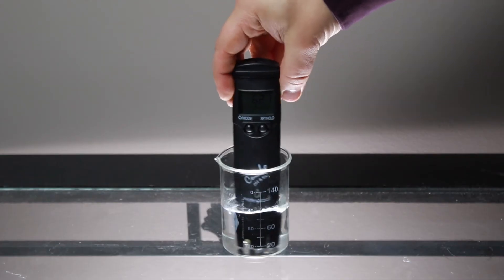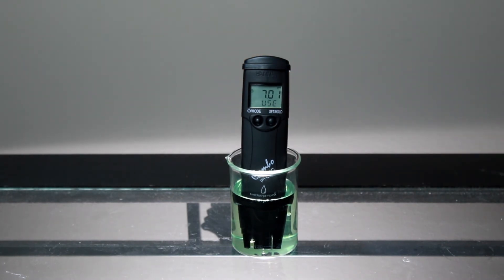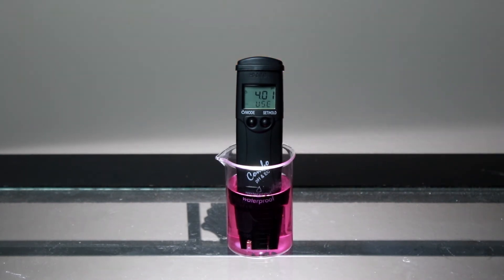To calibrate your tester to two points, rinse the tester with distilled or deionized water and place the tester in your HANA pH 7.01 buffer. Once the reading is stable, it will ask you for pH 4.01. Rinse and place the tester in your 4.01 or 10.01 buffer. The tester will automatically recognize which one you use first. After it's complete, the tester will automatically return to measurement mode.